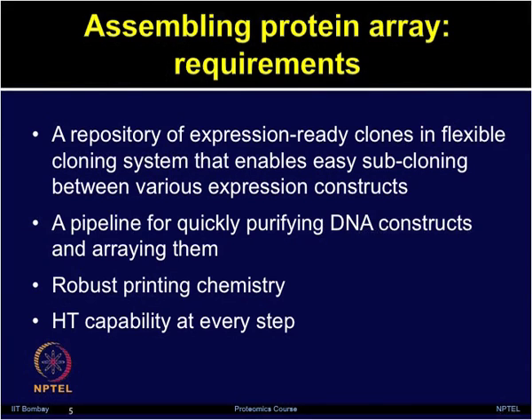So, what are the requirements to assemble protein arrays? In today's lecture, when we discuss making protein arrays, that is quite similar for most of the cell free expression based protein microarrays, and largely it can be applied to all types of protein microarray platforms, but it will be more specific in the context of NAPPA.